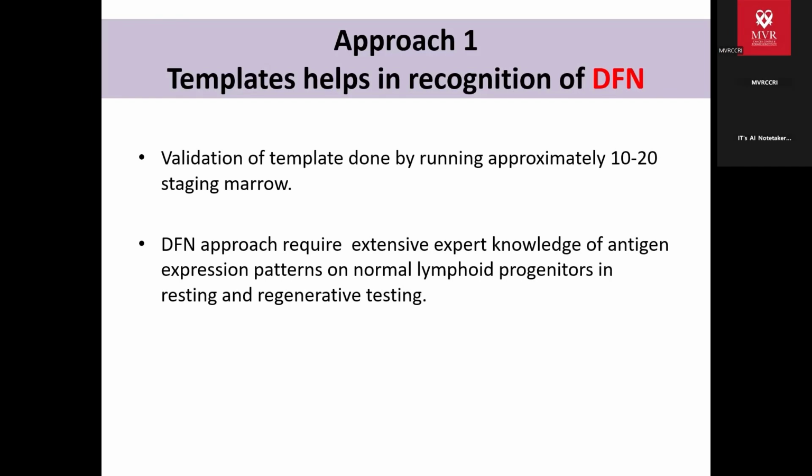The difference from normal approach requires extensive knowledge of the antigen expression pattern. We need to know what cells express what antigens at what intensity, and what changes can come following treatment. So relying only on the difference from normal becomes a little bit more tricky.